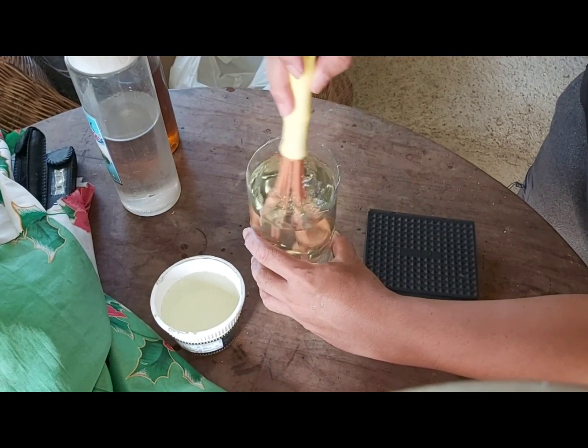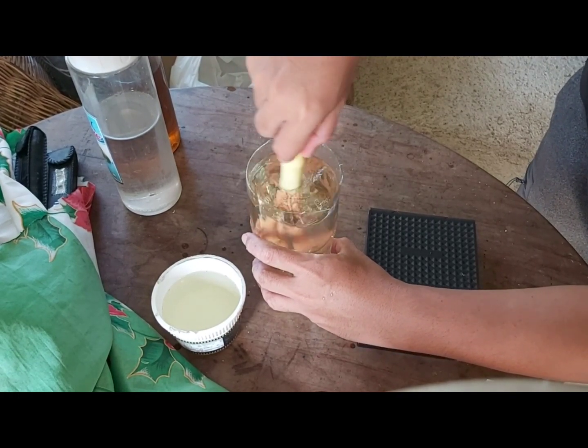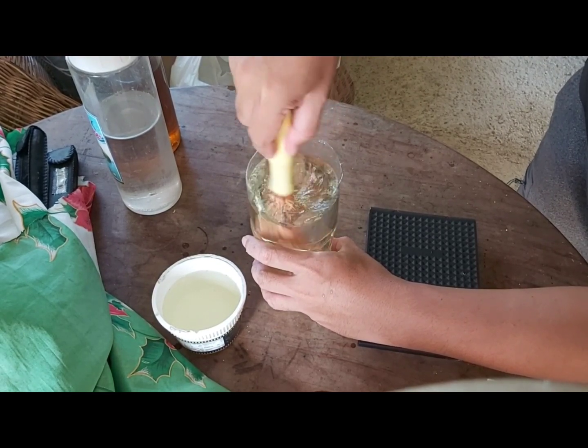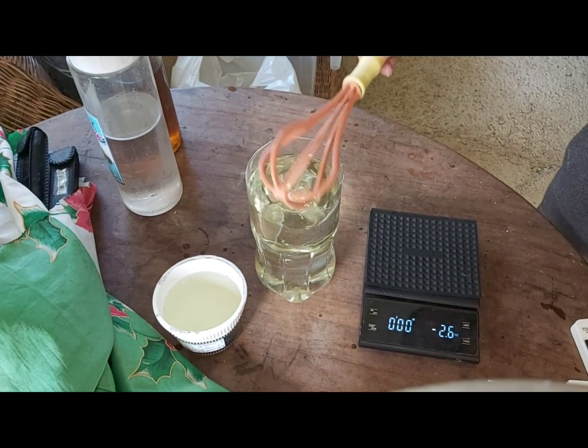After mixing this solution, store it in a container that won't be contaminated easily. You can also make a half-strength or 400 PPM solution for your reference in the future.